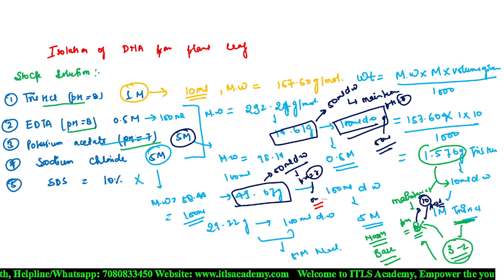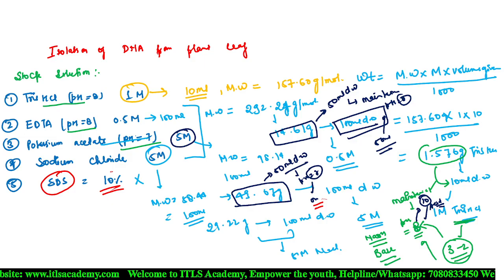Yes, ma'am. This is how you prepare your test. One more thing, you have to prepare this SDS 10%. Suppose that you prepare this 10% for 50 ml. Now tell me, if you have to prepare the 10% of the SDS for 50 ml, then how do you prepare it?